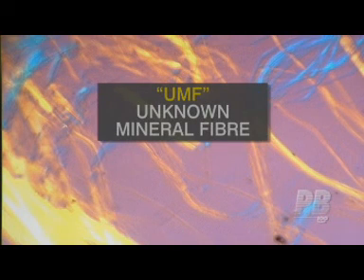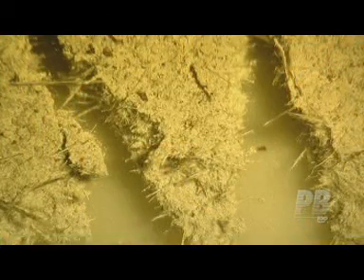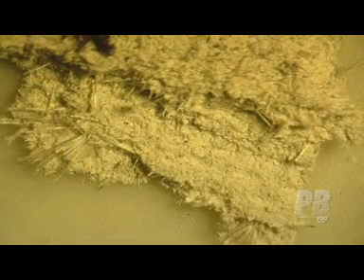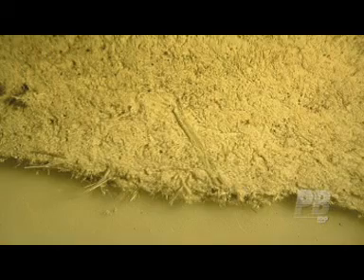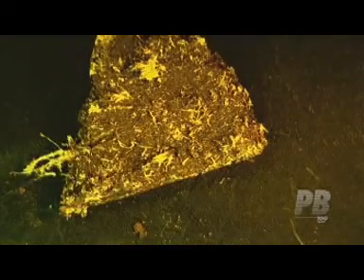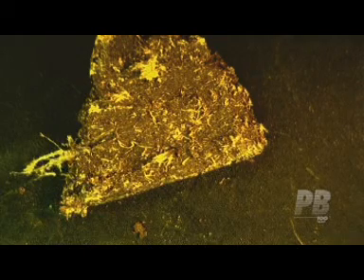In some instances, laboratory certificates may report results as unknown mineral fibre. An unknown mineral fibre result means the fibre in the sample shows most, but not all, of the optical properties of one of the commercial types of asbestos. This may be due to the fibre in the sample being affected by heat, chemicals, or adhering particles which have changed the theoretical optical properties of the fibre.